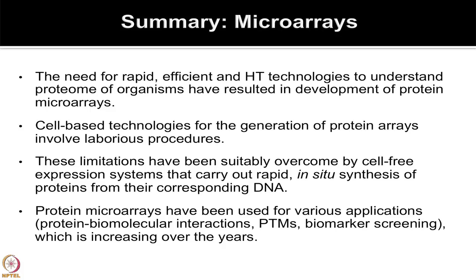I hope you are convinced that protein microarrays are a very rapid, efficient, high throughput platform to provide various types of applications. Both cell-free and cell-based arrays have been used. Cell-free arrays have overcome some limitations which were otherwise not possible using cell-based arrays. You can go to PubMed and look for literature. You will find n number of applications, whether it is biomarker discovery, looking at post-translational modification, protein interaction, kinase substrate analysis, a variety of things using arrays for every organism of interest. Of course, more on the human, but you will see n number of applications for all the life sciences.